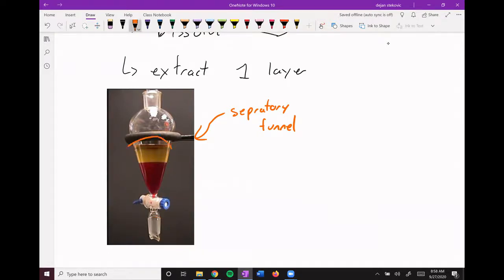Your two immiscible liquids will not mix together. And then it's got this angled part down here. And so when this little line gets closer and closer to here, the separation will get smaller and smaller. And so it'll let you separate out the two liquids quite easily. We won't use this. We'll just use a conical vial and pipette out one of the solvents, but I just wanted to show you what's more commonly used.